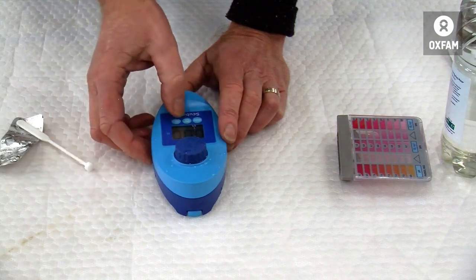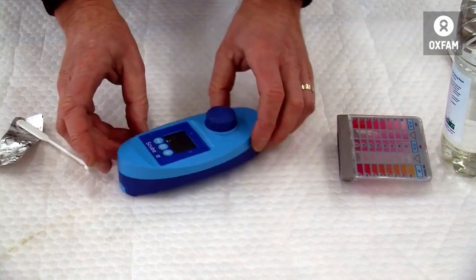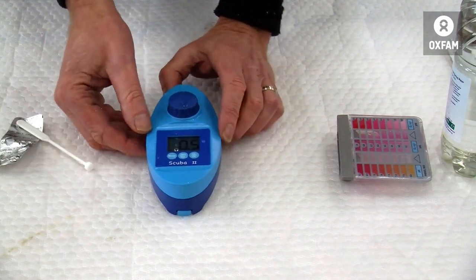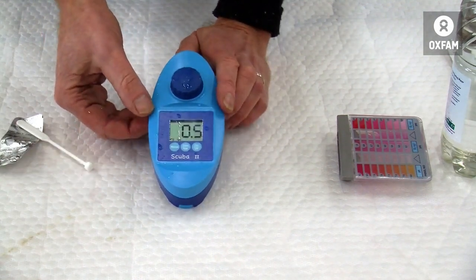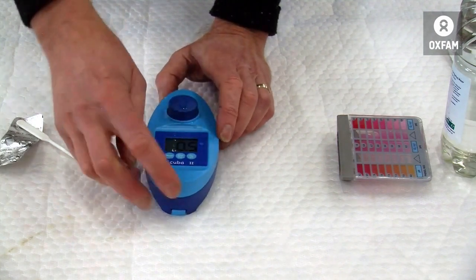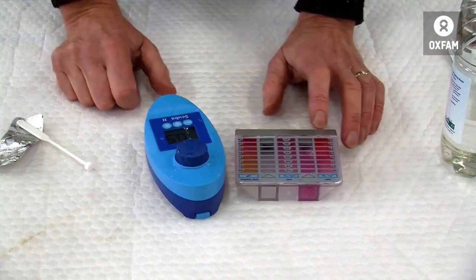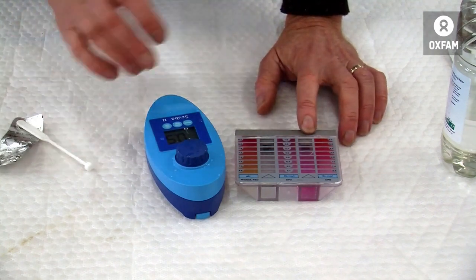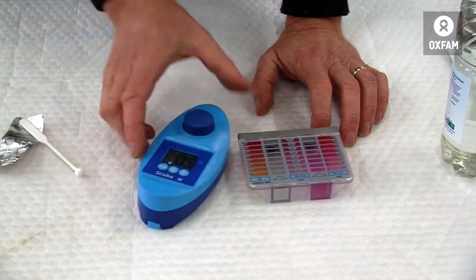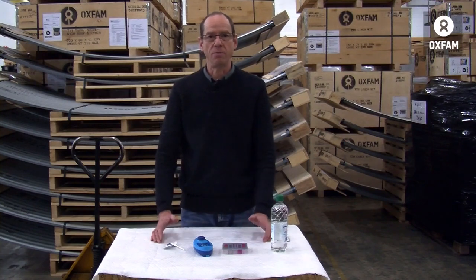And the simple test button. The device needs to be flat, obviously, because the light's going through that sample. And there's our reading. 0.5. So we were a little more vague with the pool test kit, but we knew it was more than 0.5, probably about 0.6 I'd said there. This is more accurate. Every time it's going to come out 0.5, whoever's using the equipment. So there you go, measuring residual chlorine.